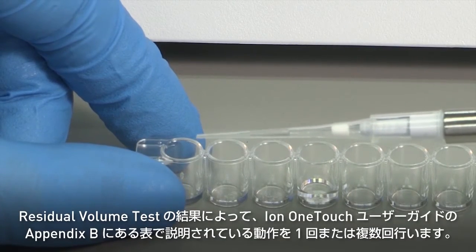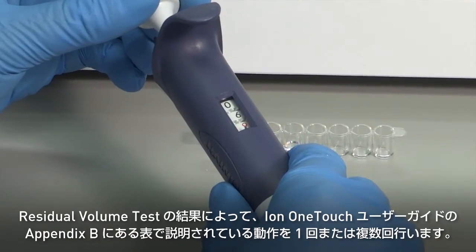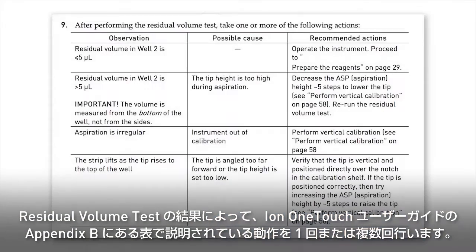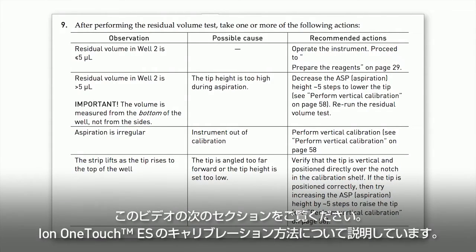Depending on the outcome of the residual volume test, take one or more of the following actions described in the table on page 52 of the Ion OneTouch user guide. If the residual volume test indicates that calibration is needed, please refer to the next section of this video, which will demonstrate how to perform the calibration of the Ion OneTouch ES.